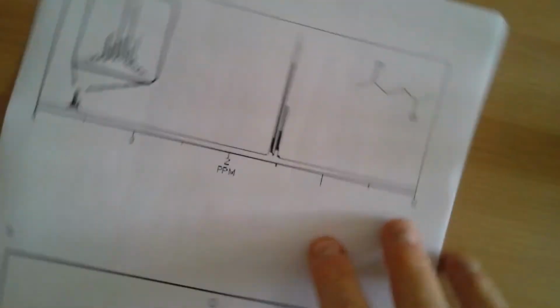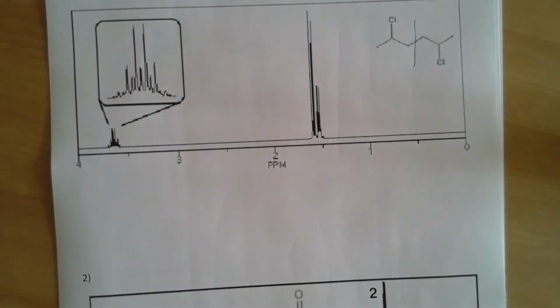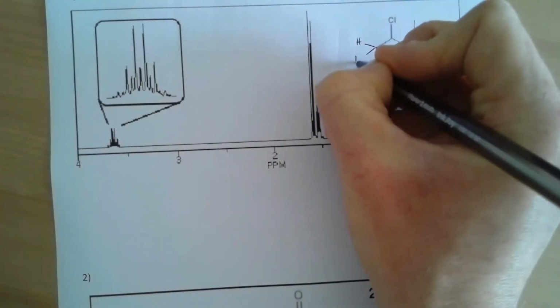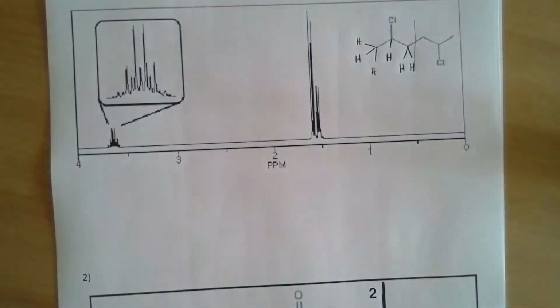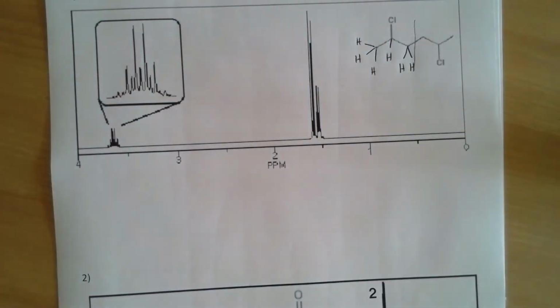So let's have a look at some real examples. This is an example that we saw when we had a look at carbon NMR, and now we're going to use it for the hydrogen or proton NMR. We recognised last time that there's some symmetry involved in that structure, which means that there are some equivalent hydrogen atoms. So if we have a look at each carbon atom here, this carbon atom has got 3 hydrogen atoms attached to it. This carbon atom here has got 1 hydrogen, and this one here has got 2 hydrogen atoms. But we know that this is equivalent to that, that is equivalent to that, and that is equivalent to that. So there is some symmetry there.